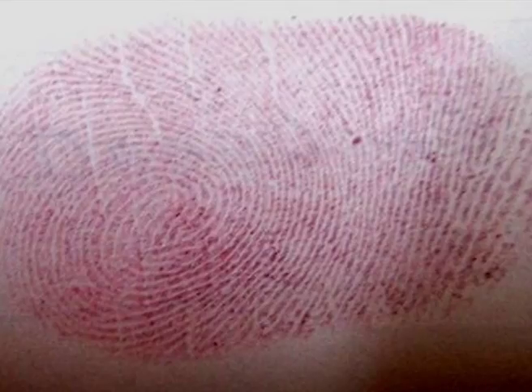The combination of electron-rich aromatic compounds and dipolar iodine results in charge transfer complexation, as has been shown on your screen. The charge transfer complex is non-volatile in nature and hence it does not evaporate from the frictional ridges. As a result, the developed prints do not fade out with passage of time. Representative fingerprints developed on different items are depicted in this figure on your screen.